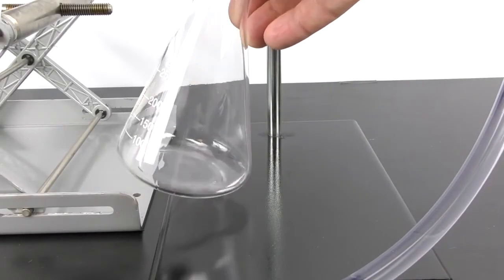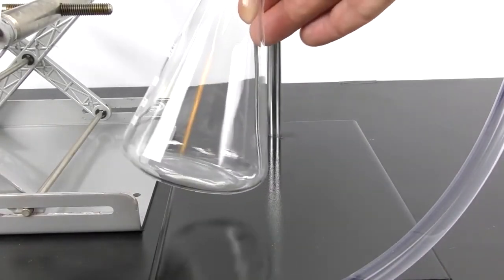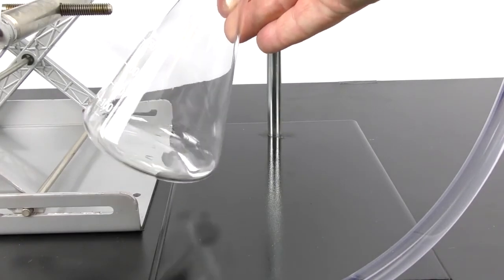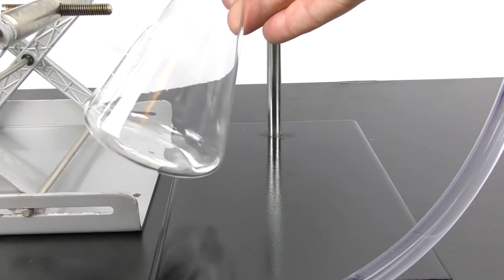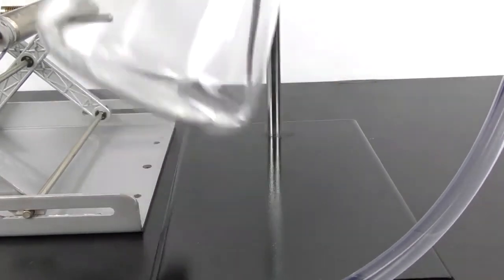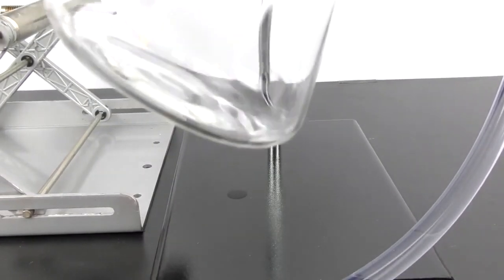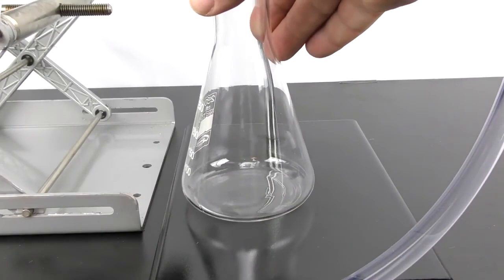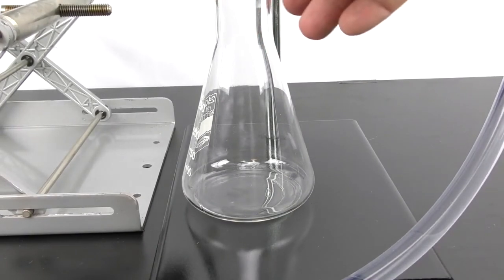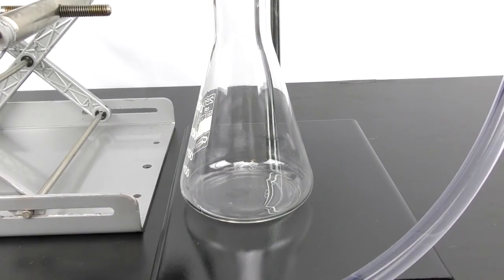Now partway through the distillation I switched to a smaller collecting vial because this kept evaporating on me, but I did get quite a bit of pure alcohol out of there. And I know you can't smell this but it is definitely alcohol, it is not water.